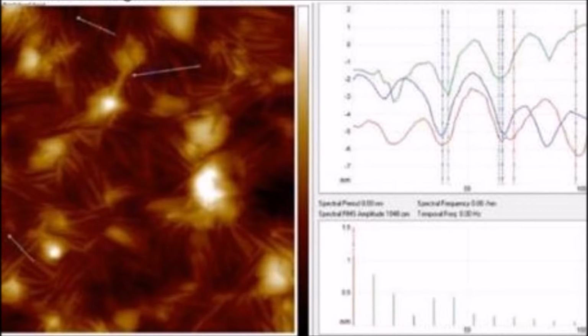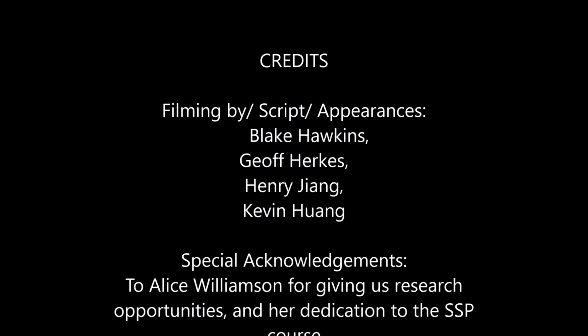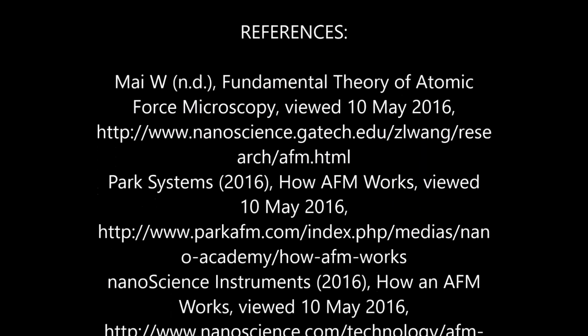This 2D image is of nanoparticles on a mica surface. The large dots are likely to be dust particles, but the small dots in the top left could be the nanoparticles that we're looking for. This 2D image is of silver nanoparticles on a silicon wafer. To the right, you can see some of the vertical cross sections. This image is a 3D dataset of the last 2D image. It shows the topography of the surface being examined. Therefore, AFM is a very useful technique since it provides us with the force to examine even the smallest of particles.